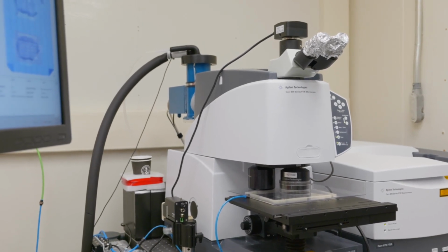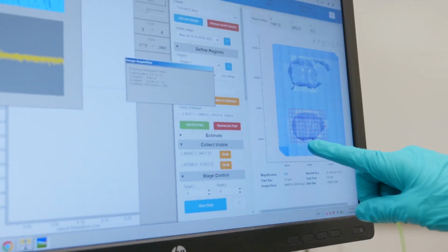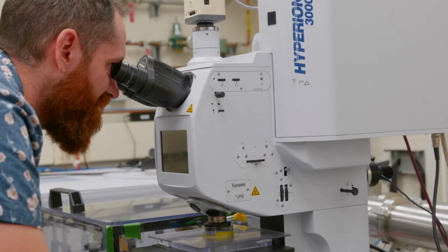When it comes to what a sample looks like, pretty much everything is able to be measured in the infrared. We can measure gases, we can measure liquids, we can measure solids, we can measure irregular shaped solids. All these things are accessible. We can do that here.